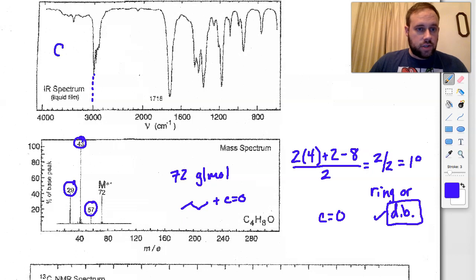So that means we certainly don't have any type of aromatic. Because we know from the degrees of unsaturation you'd need at least 4 for an aromatic, we don't have one. We did say there's the potential for a double bond, but we don't have any carbon-carbon double bonds with a CH stretch, because that would belong north of the 3000 region, and we don't see that there.